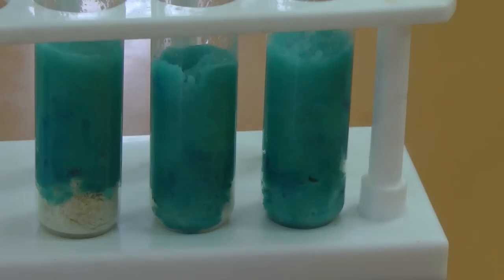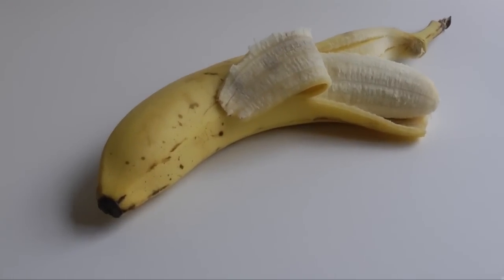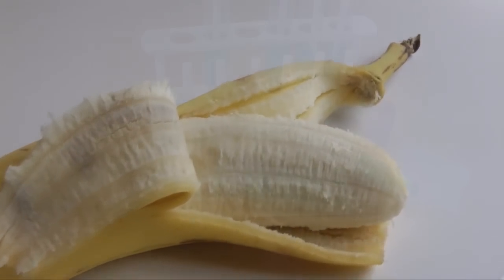You can prepare your own Drosophila media. Something as simple as banana mixed with yeast will work. Search the internet and you'll find a number of different recipes.